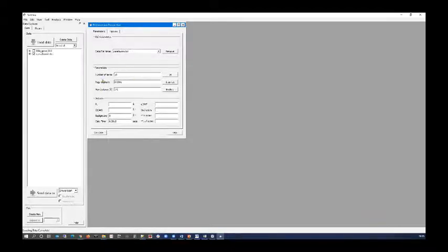So here in the middle, we have some parameters which are controlling the inversion process. And in the boxes, we have some starting values. And over here on the buttons, we have some suggested values that the program is making based on looking at the data. And if you click the button, it will set the value in the box.